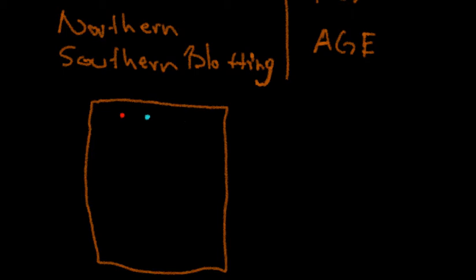So let's actually do keratin across species, because that might be interesting as a general biologist. Or maybe somebody gave you some hair and you're working in a forensic lab, and your job is to say, you know, gee, is this hair from a human victim, or is this from an animal that attacked her or him? And if it was an animal, were they eaten by a bear or a rabbit? Okay, so we gotta get the species of animals. So the first thing we want to know is how big is the keratin molecule.